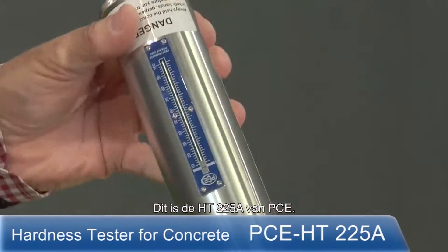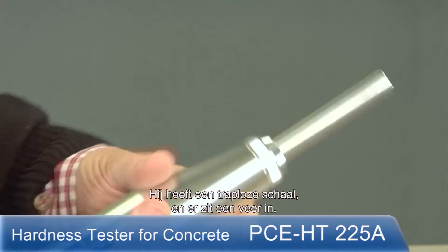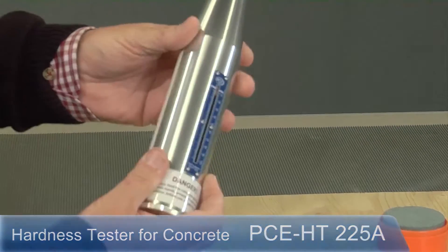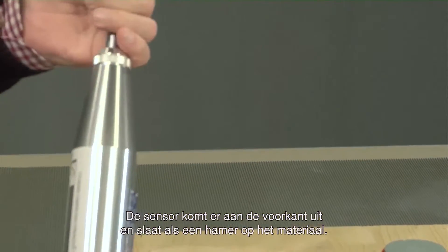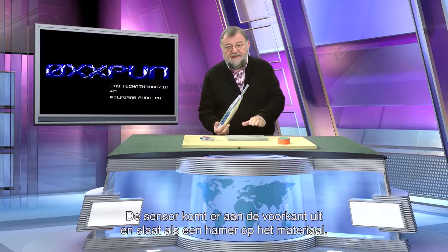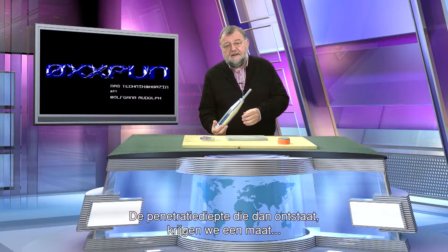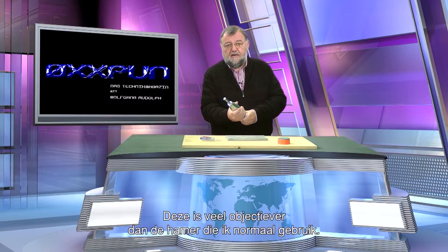That is the HT-225A from PCE. It has a scale and is dimensionless, and it has a spring inside. The spring is tensed, and then the bolt is triggered. This sensor at the front comes out and strikes like a hammer onto the material, and because of the penetration depth, I get a measurement which I can read. One kilo acts as the hammer force, making it more objective than a hand-held hammer.